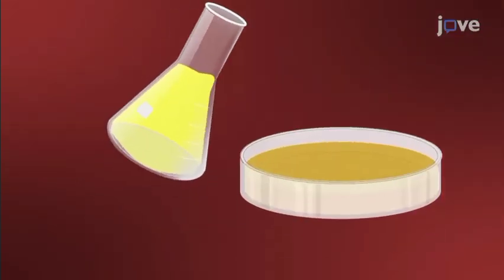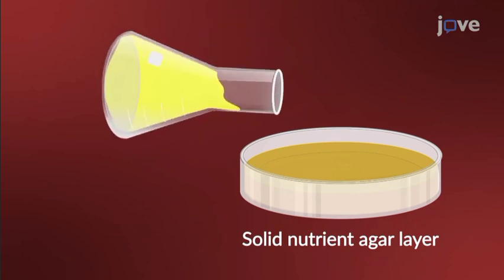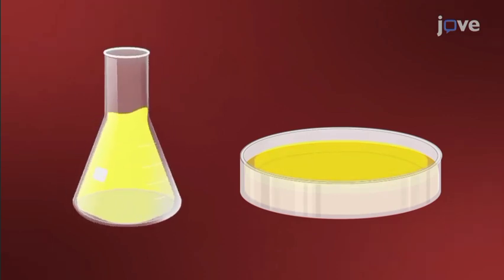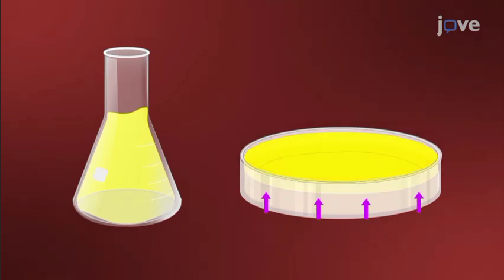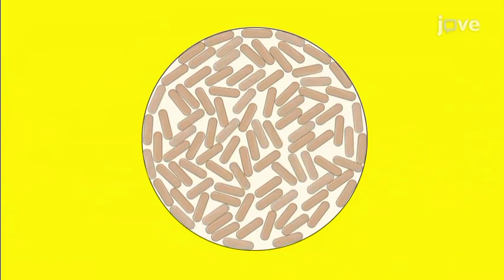Next, this molten bacterial phage agar mix is spread over a more solid concentrated agar nutrient medium, which is already solidified on a petri dish. On incubation at room temperature, the low-concentration agar phage bacteria broth also solidifies to form a soft agar overlay. Here, the bacterial cells can derive additional nutrients from the bottom layer and should rapidly multiply to produce a confluent lawn of bacteria.